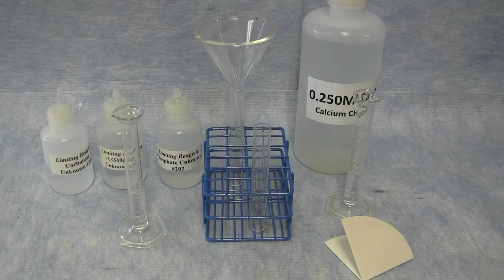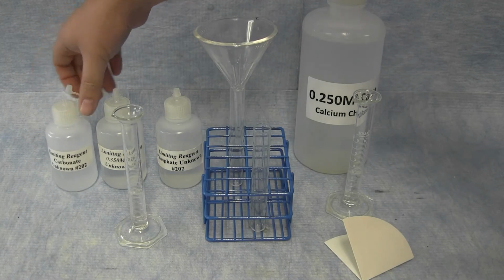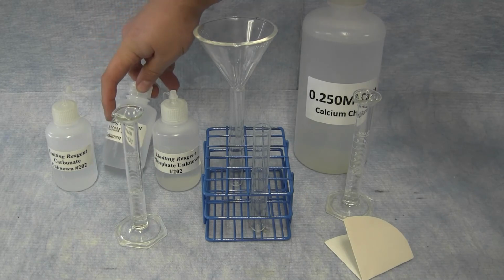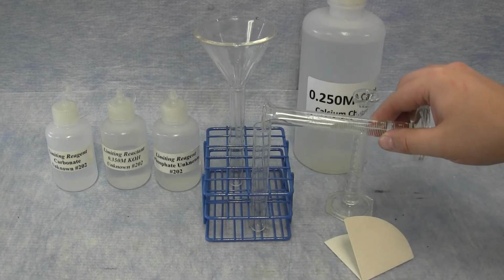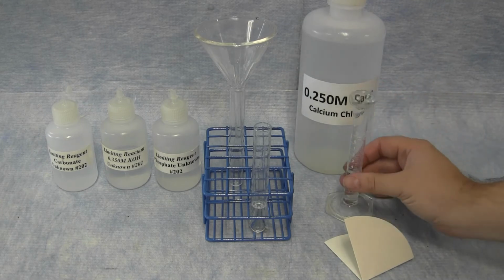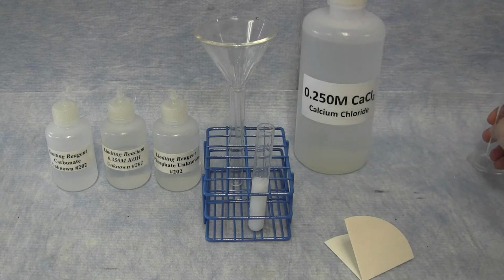The first part of the experiment looks at 3 different precipitation reactions, all involving calcium chloride. You'll be reacting an unknown of a carbonate and a phosphate, as well as potassium hydroxide, which has a provided concentration. For all 3 of these reactions, you will combine 5 milliliters of your unknown and 5 milliliters of calcium chloride. In each reaction, it will form a white precipitate.